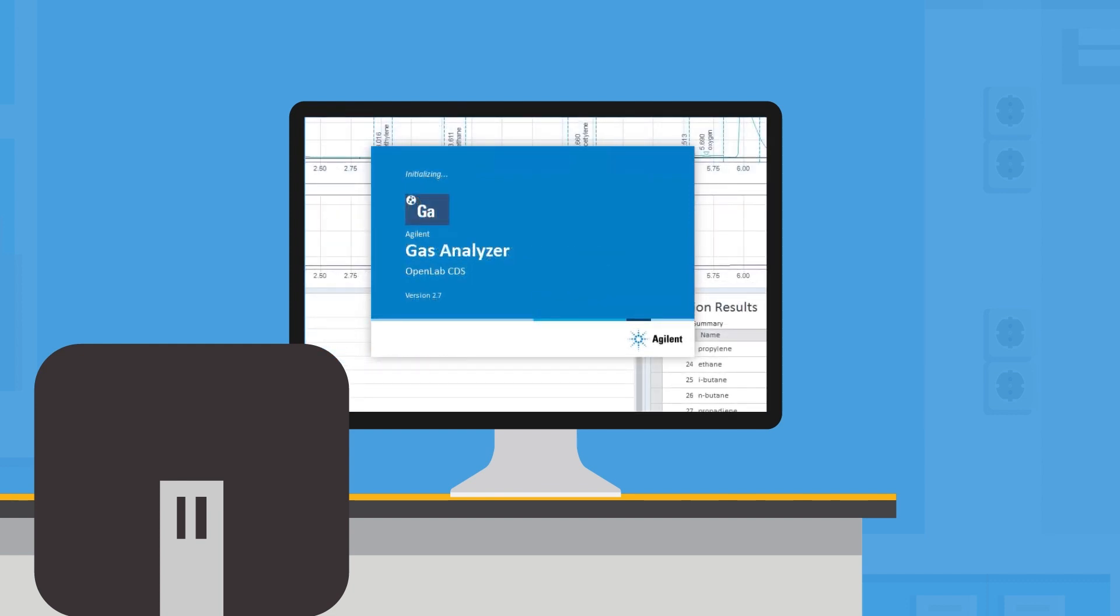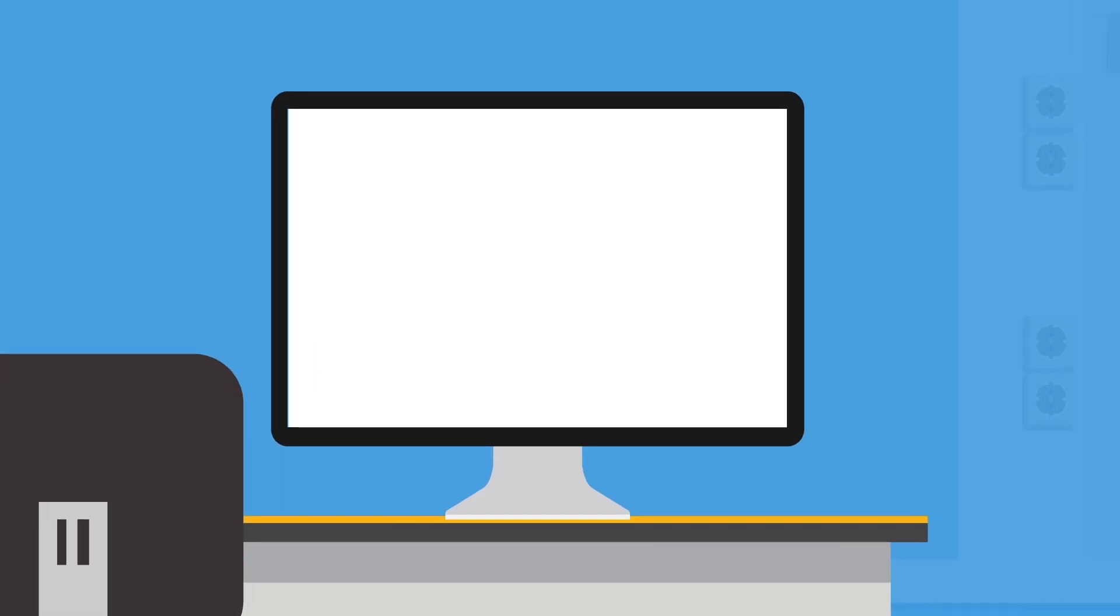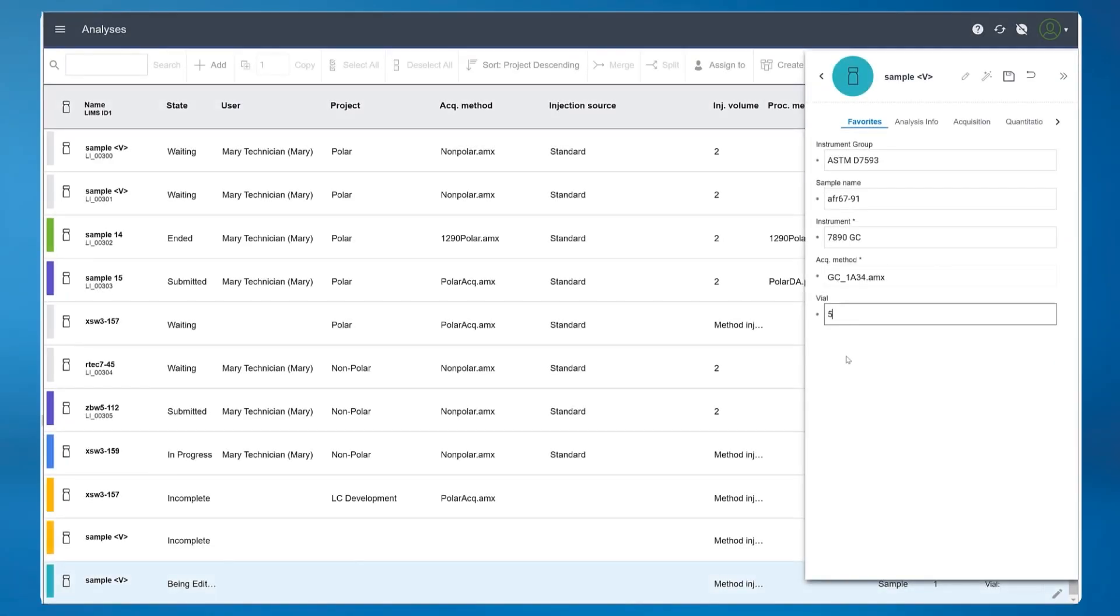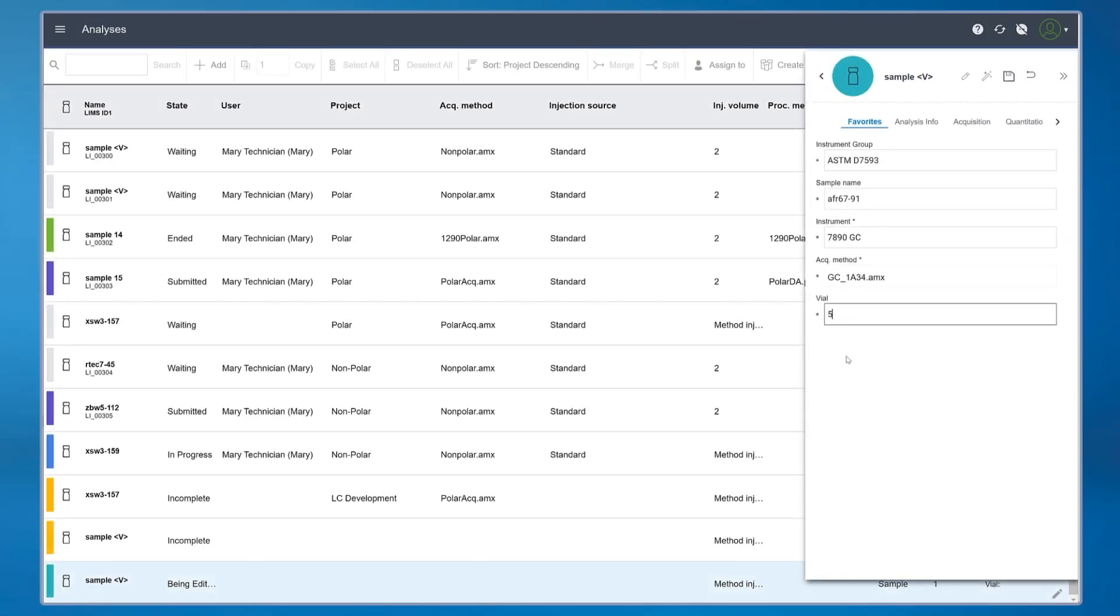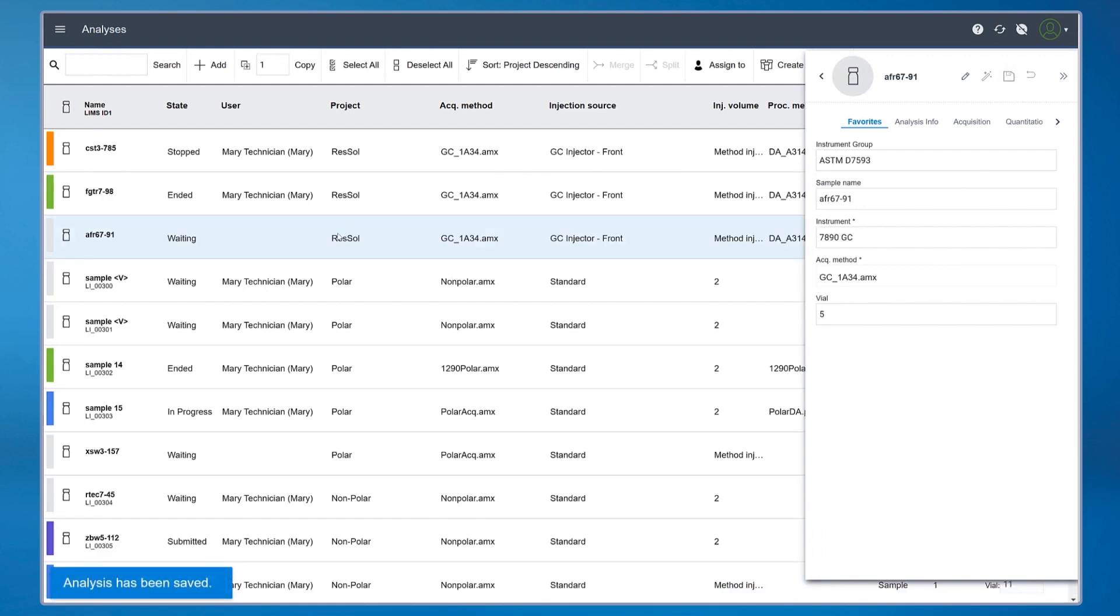OpenLab CDS, along with Sample Scheduler, gives you flexibility in sample submission. Have a high-priority sample? No problem. Add your sample to the top of the queue.